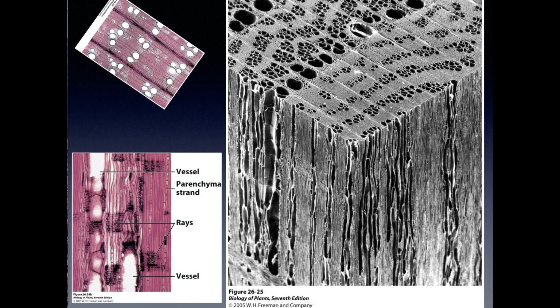And the wet part of the year will result in the xylem looking a bit lighter, like we're seeing there. The lines right here represent the drier season, where the cells are much smaller and therefore they appear darker. Now this next picture, on the right here, is a scanning electron microscopy image of a chunk of wood that has been sliced very nicely and neatly with a razor. This is a picture that's been zoomed in many hundreds of times, and it's not a normal microscope. This is a scanning electron microscope.